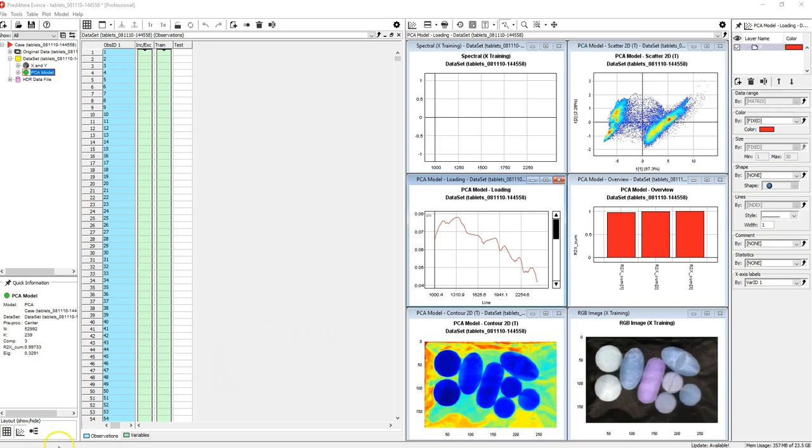Assuming you have successfully imported an image file into EVINS, your screen should look something similar to this.